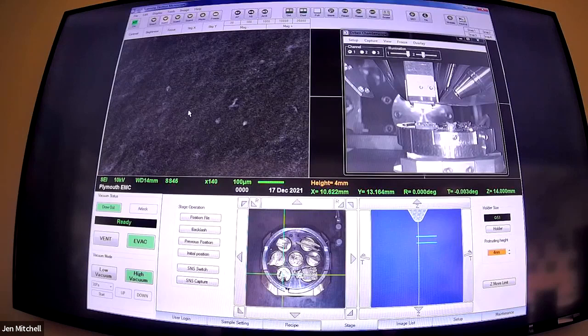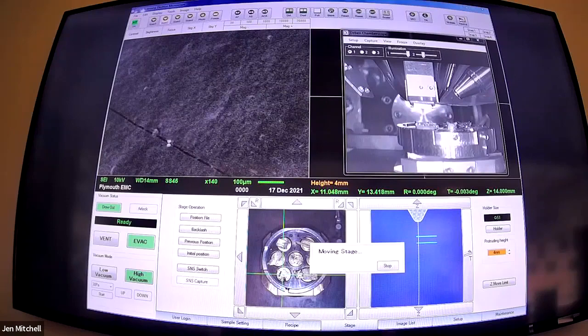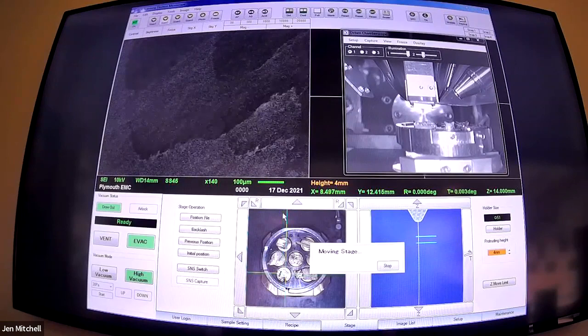I can't tell what I'm looking at - that's not in focus at all. There's less to see on this one - we will tell you. This is the top side of the holly leaf. I believe you don't have the collection of stomata in the same way on the top of the leaf.